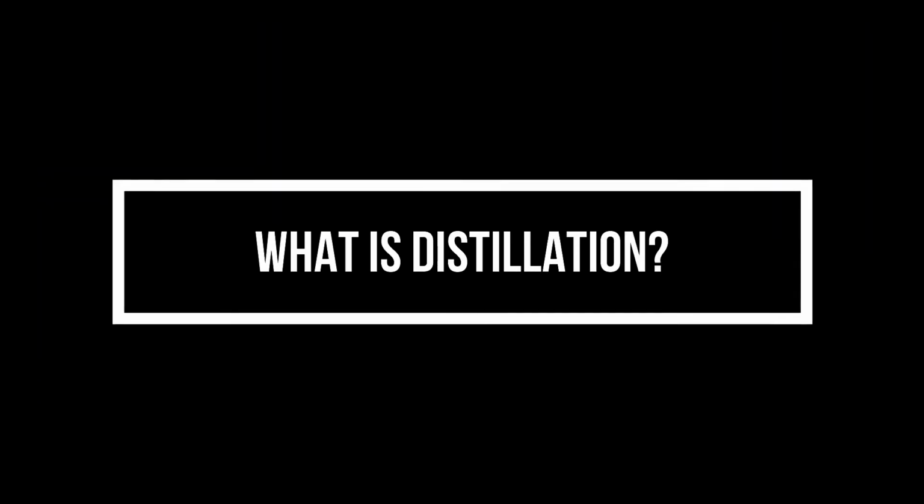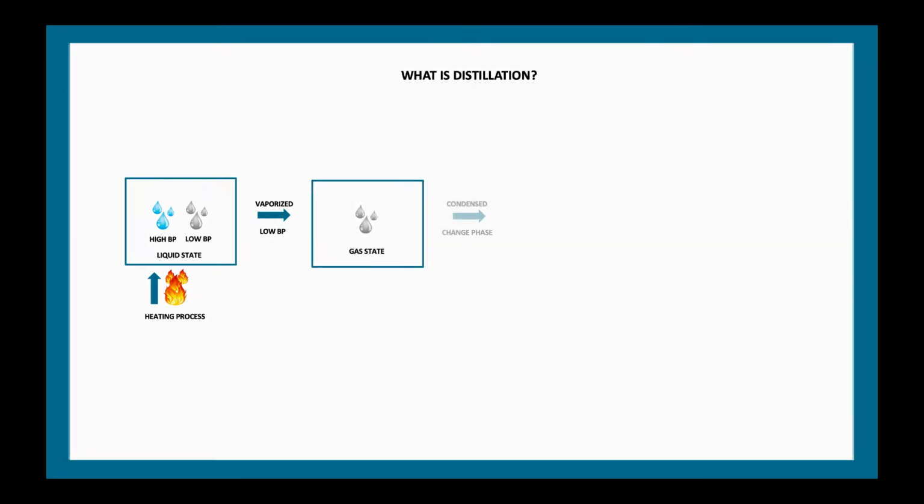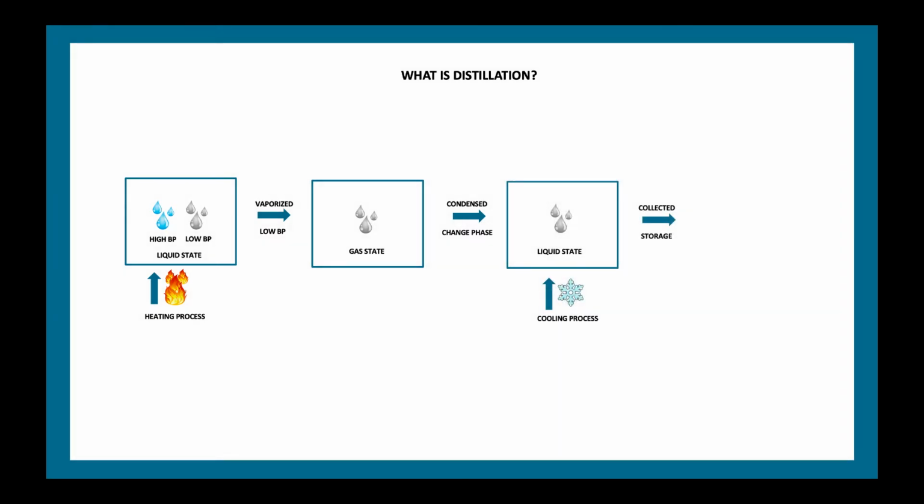What is distillation? Distillation is the method of separating mixtures based on differences in volatility of components in a boiling liquid mixture, thus separating hexane from the oil hexane solution. Samples need to undergo this unit process.